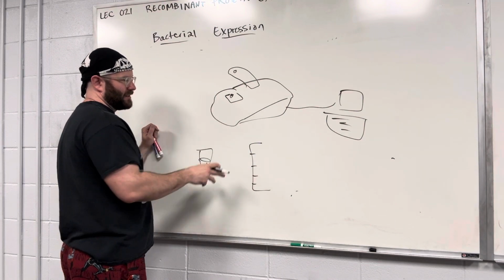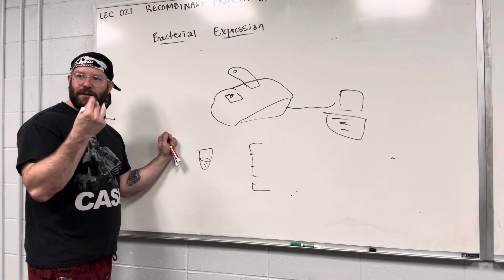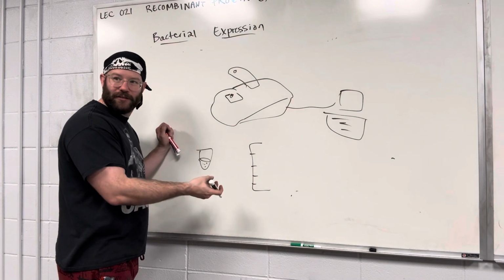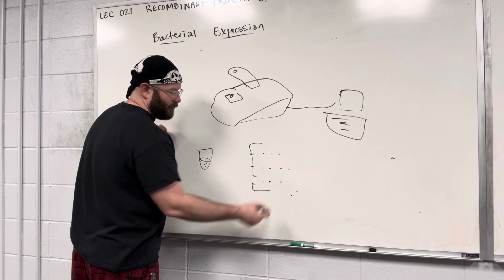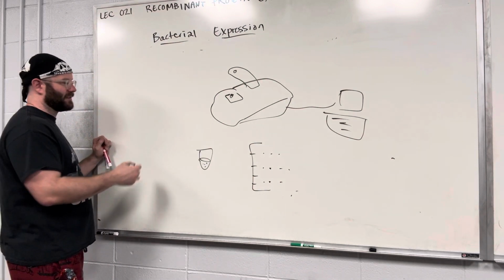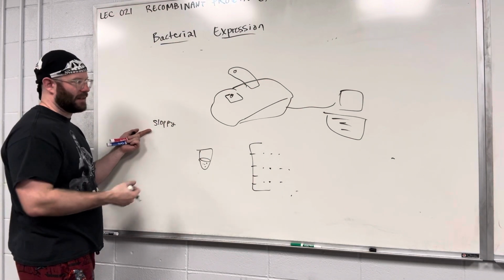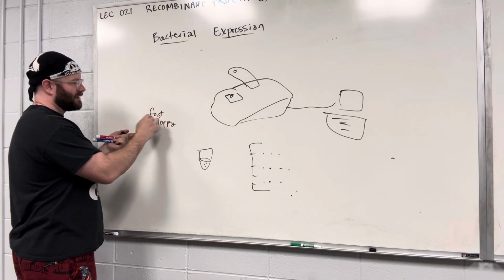The reason that you can do this is that physically, different amino acids absorb different wavelengths, and certain amino acids can be used to create a standard concentration of how much protein is there. So you'll get some numbers based on different absorbances, and you can use those numbers to calculate a yield. The downside of the nanodrop is it's sloppy. For proteins, it's sloppy. Nanodrop is more useful for DNA quantification through the same methodology. It's a little bit sloppier for proteins. So I'd say that this one is kind of like fast and sloppy.